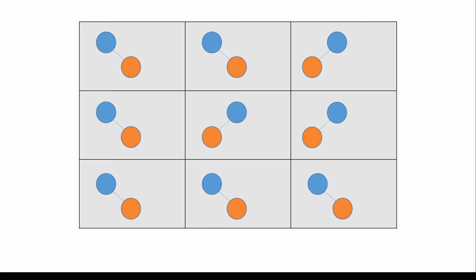Ideally, for us to model it, this disorder is uncorrelated. That means the configuration of one unit cell doesn't depend on its neighbour. We've got a picture here of a disordered crystal with a diatomic molecule of some sort, and you can see in 3 out of the 9 unit cells it has a different conformation.